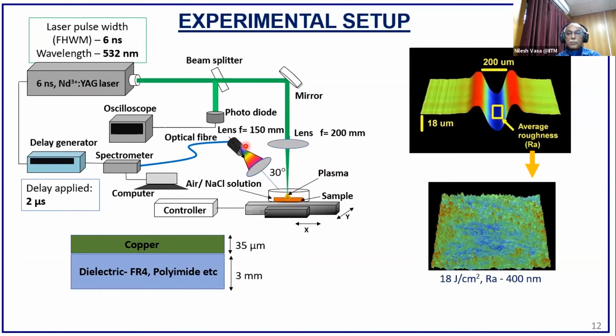Those optical emissions, which are nothing but the LIBS spectra, can indicate the presence of copper, or the depth that we can achieve. So we wanted to see the depth calibration of this copper while the scribing process is on, and whether we can achieve that or not was the idea.